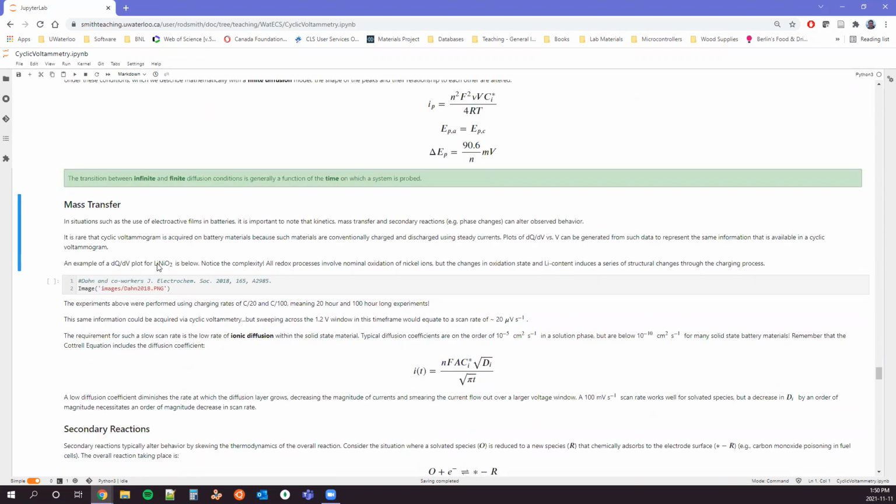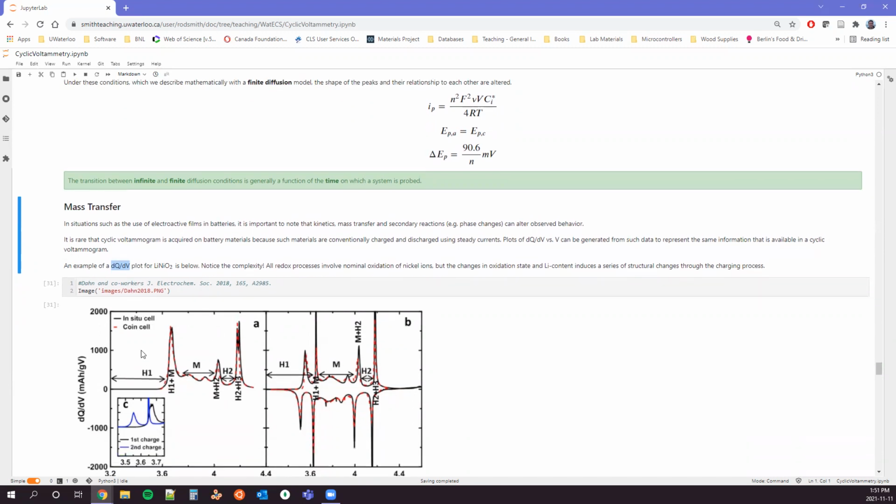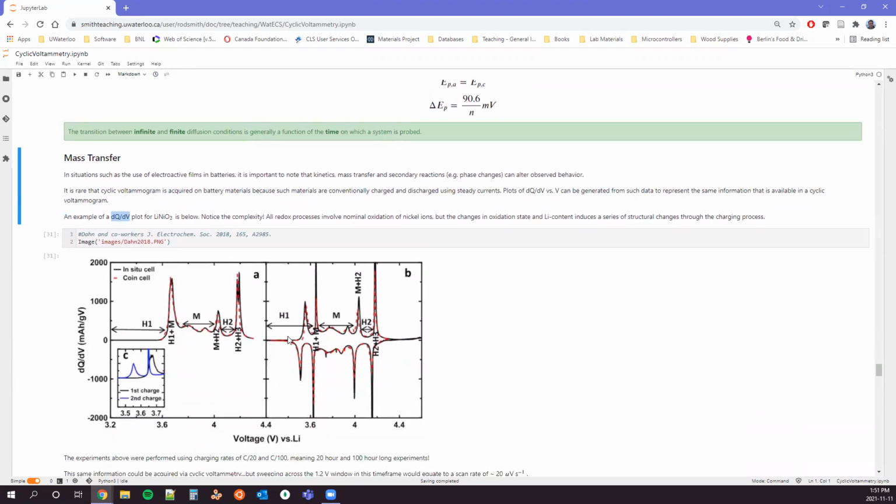And so in terms of mass transfer, I grabbed an example from Jeff Dahn's group here for lithium nickel oxide, because he's got some beautiful structural and electrochemical data inside of it. What he's doing here, it's not very common in battery research that you'll see cyclic voltammetry. Instead, you charge by constant current, but you can take that current and convert it into this derivative plot. And so you can take the derivative of charge over the derivative of voltage. And this gives you essentially the same thing as a cyclic voltammogram. And so we see the same type of information coming out of this.